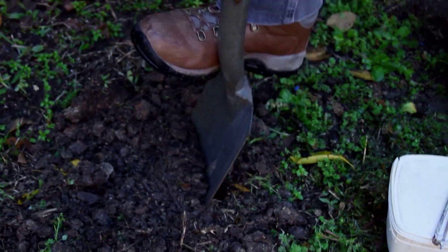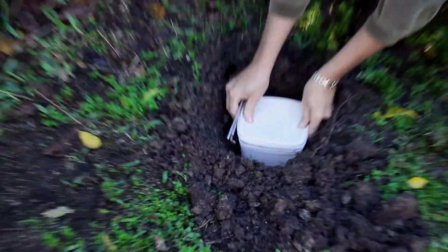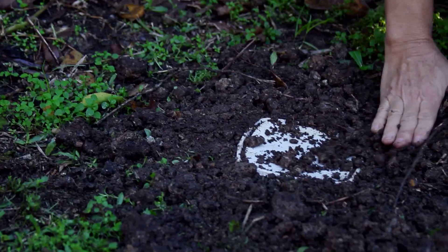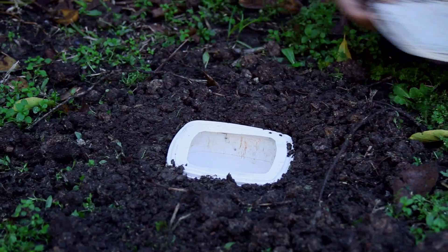You dig a hole that is level with the ground. That container then goes into the hole and the soil is brought back around the containers and firmed down. Lift off the complete lid, exposing the pitfall trap.